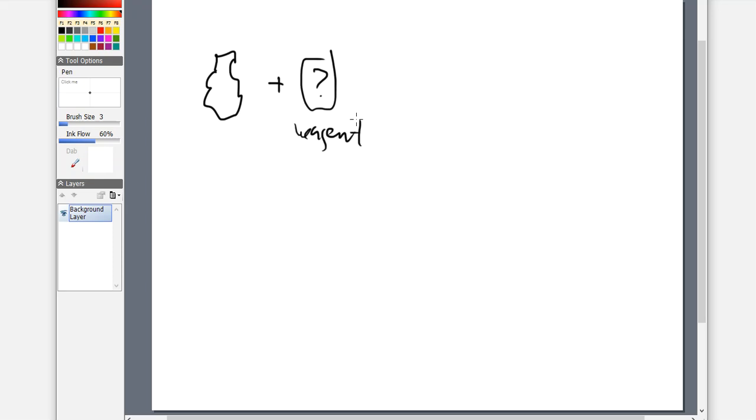So this concept is that I'm actually doing a reaction here. And that reaction is going to give me a bloop with an extra little piece that hangs off. And that is what we call derivatization. We are adding something to these compounds. We are changing it in some form or fashion, right? Doesn't necessarily have to be adding something. We can just be changing the structure in some form, some fashion to get it to respond to these other wavelengths or to 254 and 350 and 366 way better than if we did not derivatize it in the first place.